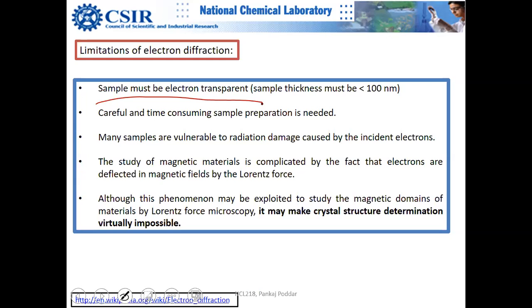If you are just interested in showing the size of your skeleton, then the outer circumference will just be dark. If you want to see just the size of the bone of your hand, that doctor will show you, no problem. But if you are interested in finer details, then it needs to be electron transparent or X-ray transparent, at least partially.